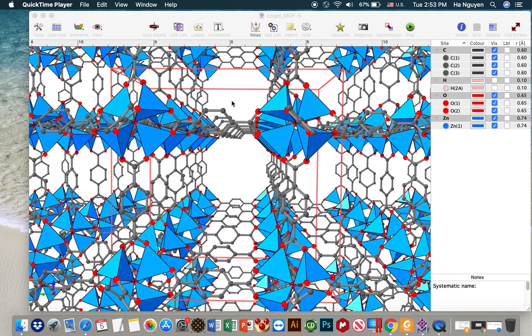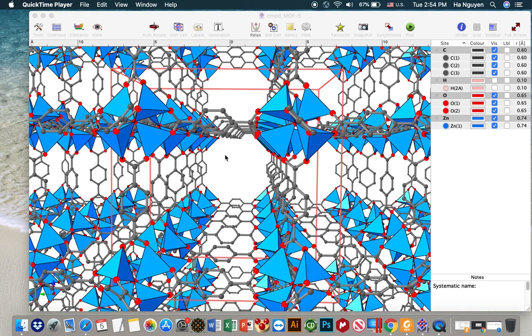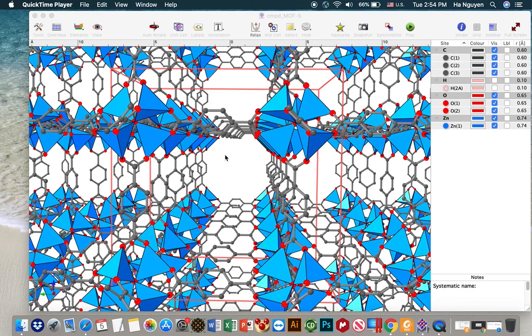Hello everyone. In lesson 1, I showed you how to deal with the crystal structure of a MOF. In here, I would like to show you how to present the pore of the structure and distinguish the linker in case you have one linker but a very complicated structure, or you have more than one kind of linker in the structure. Let's say you have a mixture of linkers which construct a complex metal-organic framework that you need to recognize clearly. So I will show you how to do that.